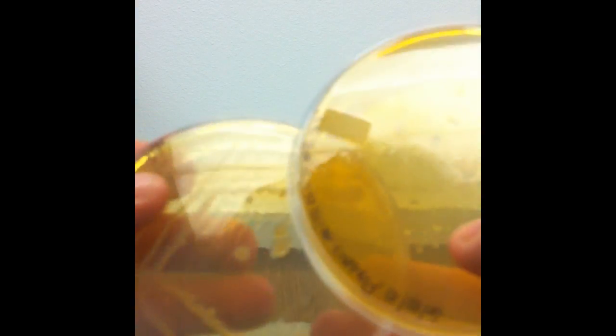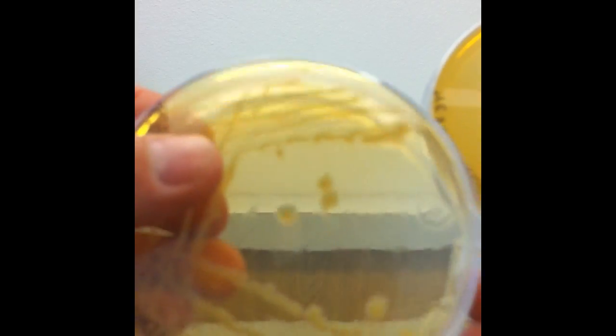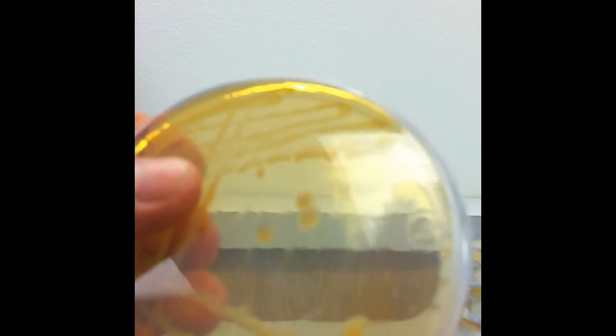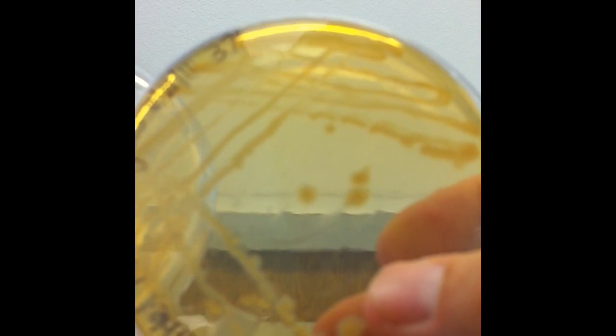But probably more important on both these Proteus plates, if you notice the agar has got kind of an amber orange tint to it. That did not start out that way. This was like any other trypticase soy agar. It started out clear, and Proteus tends to make its agar this amber brown color. A great tip that you might have Proteus.